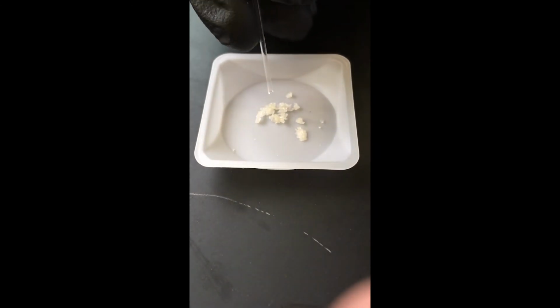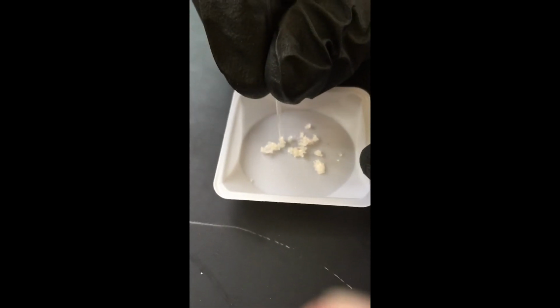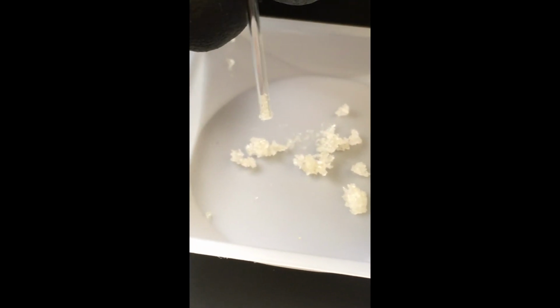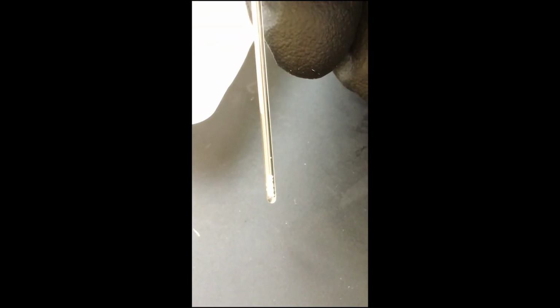Alright, so I'm going to go ahead and prepare these crystals for a melting point. So I'm just gently tapping them into this capillary tube. So you can see I've got some crystals there in the mouth of the capillary tube, and I'm just going to tap those down until they're in the bottom. So after a little bit of tapping, this is now ready to be inserted into the melting point apparatus.